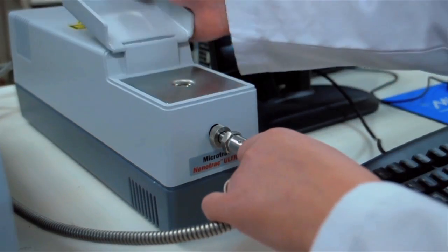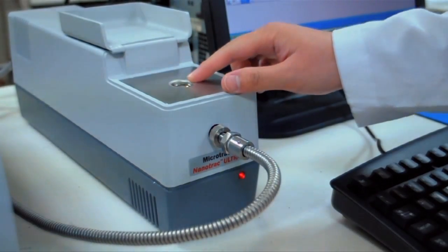Alternatively, if there is only a small amount of sample available, you can use the built-in sampling cell.